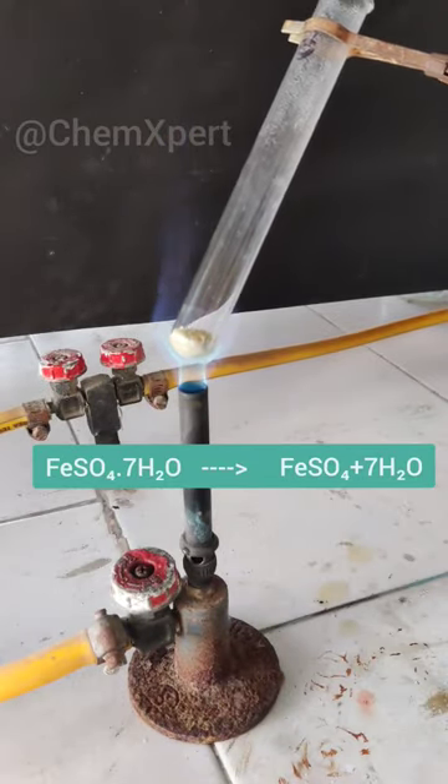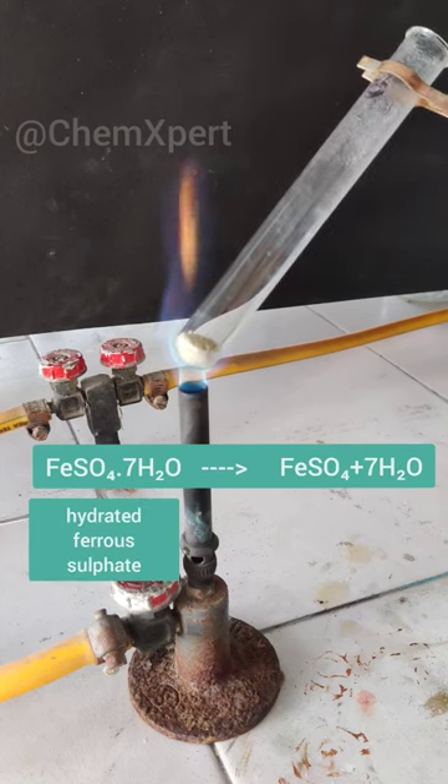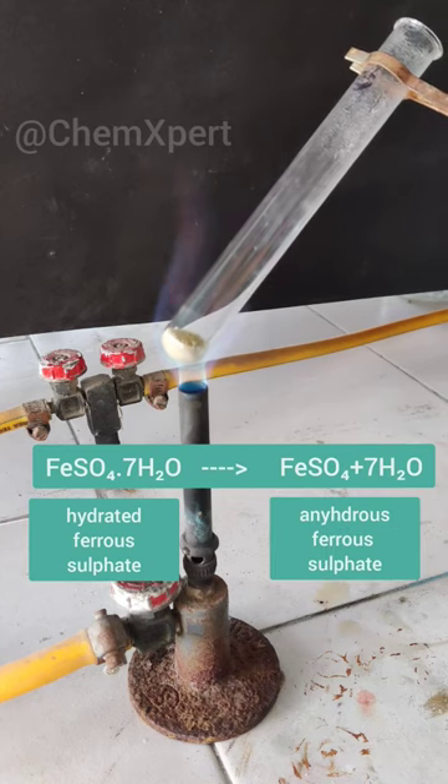Firstly, the green colour changes to white, i.e., hydrated ferrous sulphate changes into anhydrous ferrous sulphate, which is white in colour.